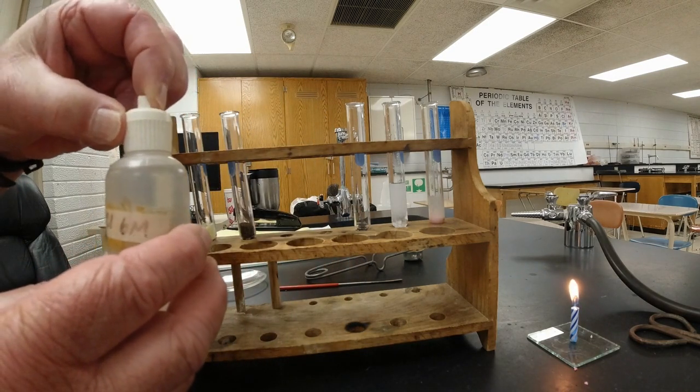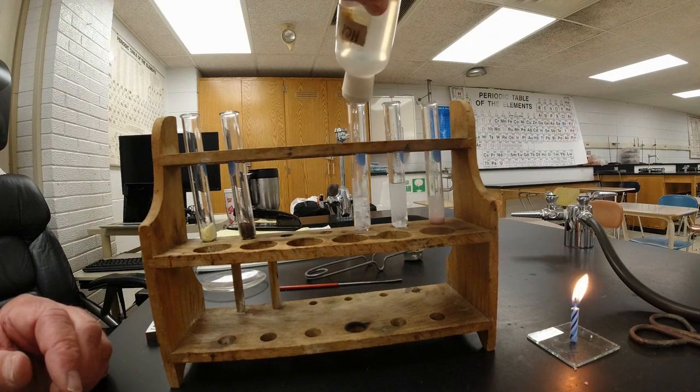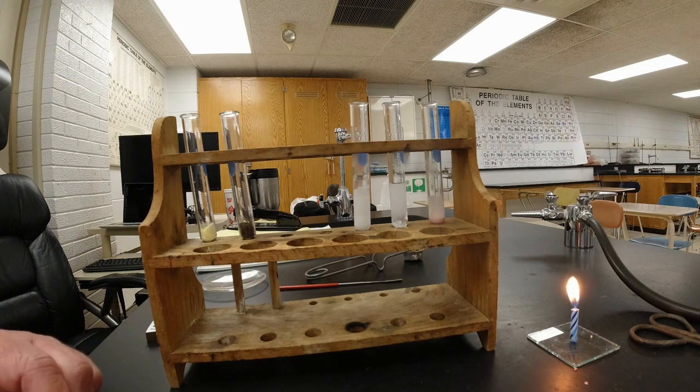So what I'm going to do is open this up, and put a little bit of acid in here. And immediately you can see what a violent reaction that is. That is really reacting fast and hard. There's all kinds of bubbles being produced. What's making the bubbles in there? Well, there's probably a gas being produced, right?